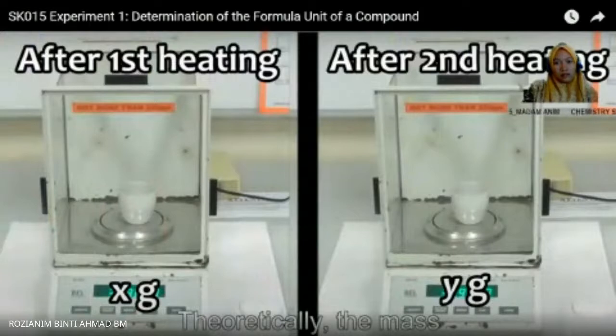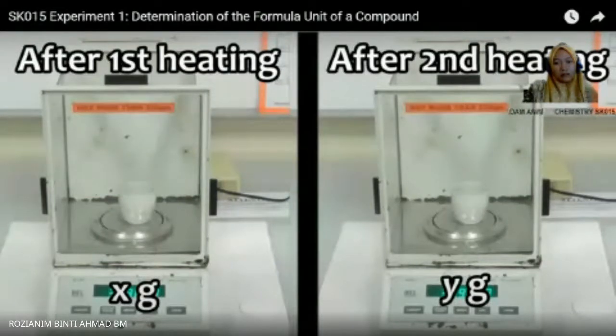Theoretically, the mass of the crucible plus mixture after the second heating will be equal to the mass of the crucible plus mixture after the first heating. But if the mixture is not really dry, the remaining hydrogen chloride and water will be removed. The mass of the crucible plus mixture after the second heating will be less than the mass of the crucible plus mixture after the first heating.